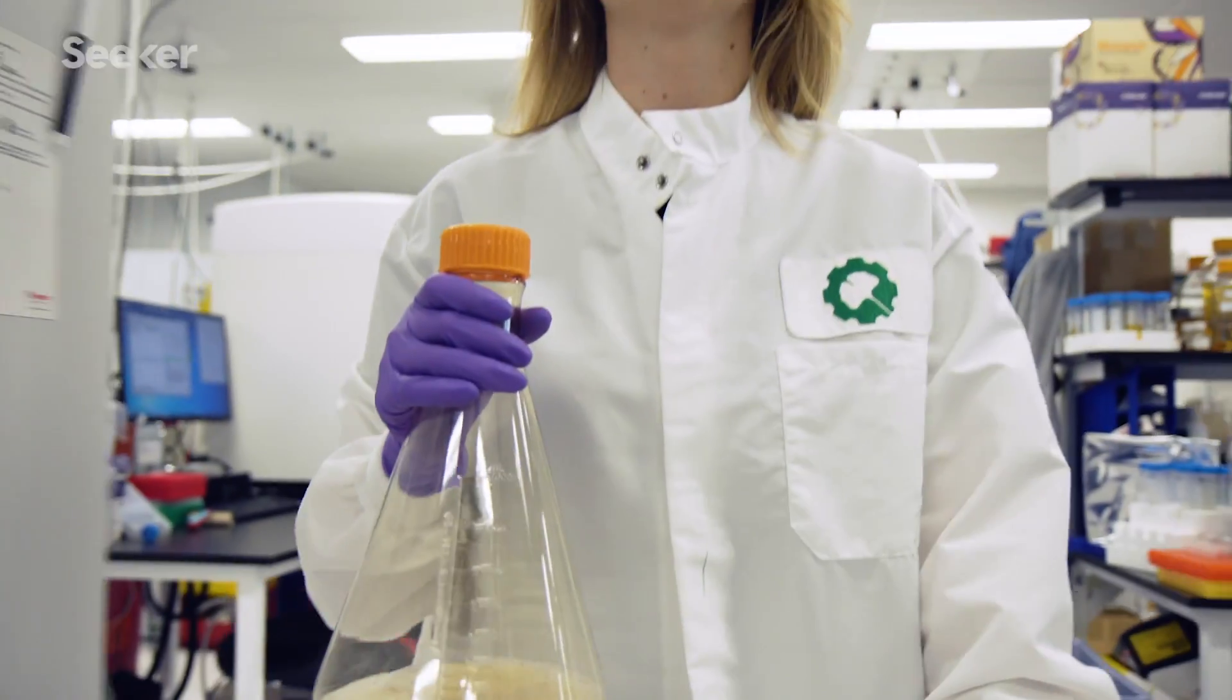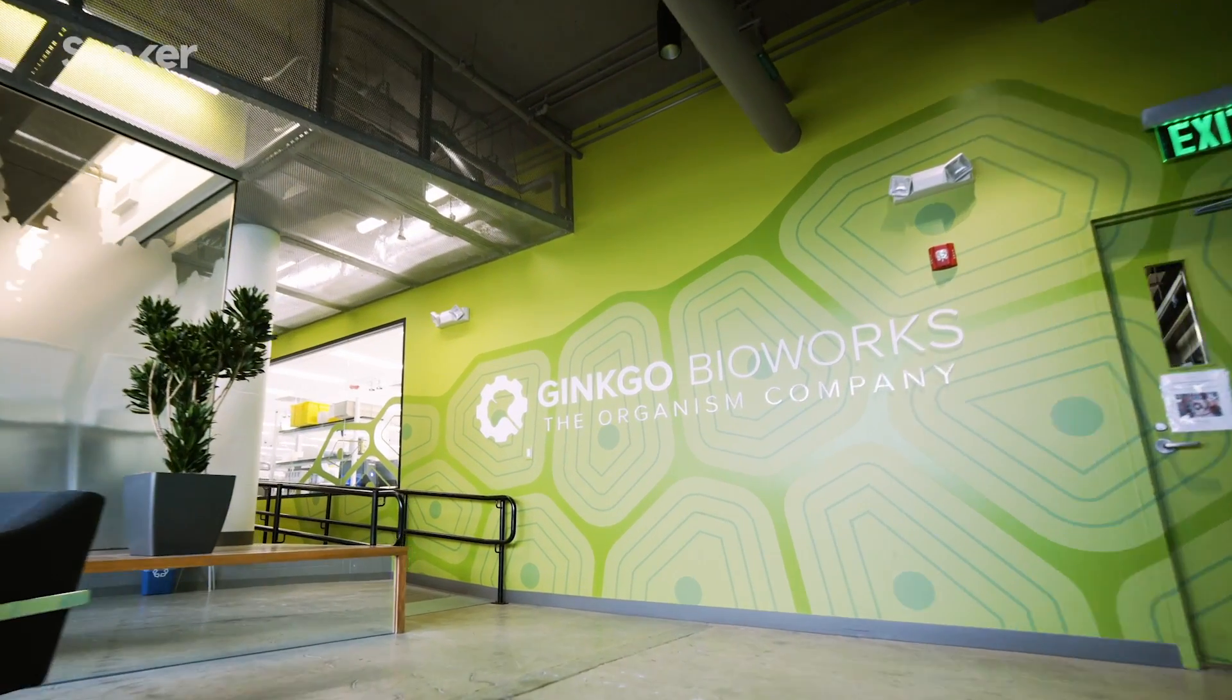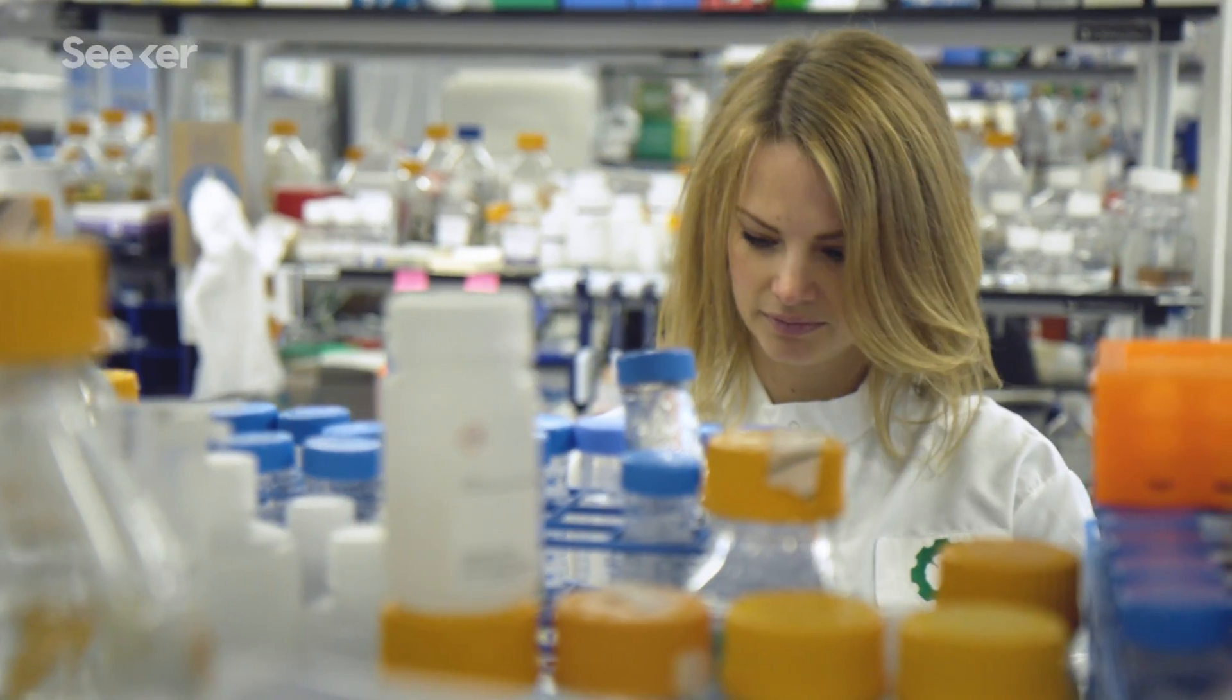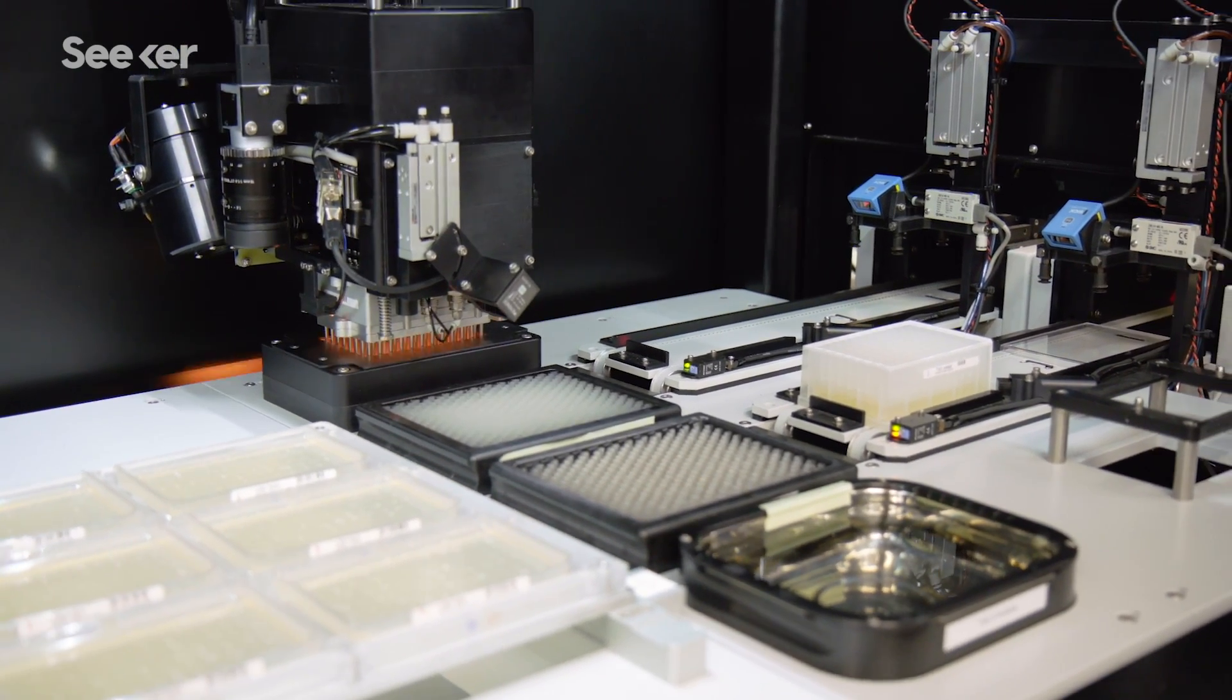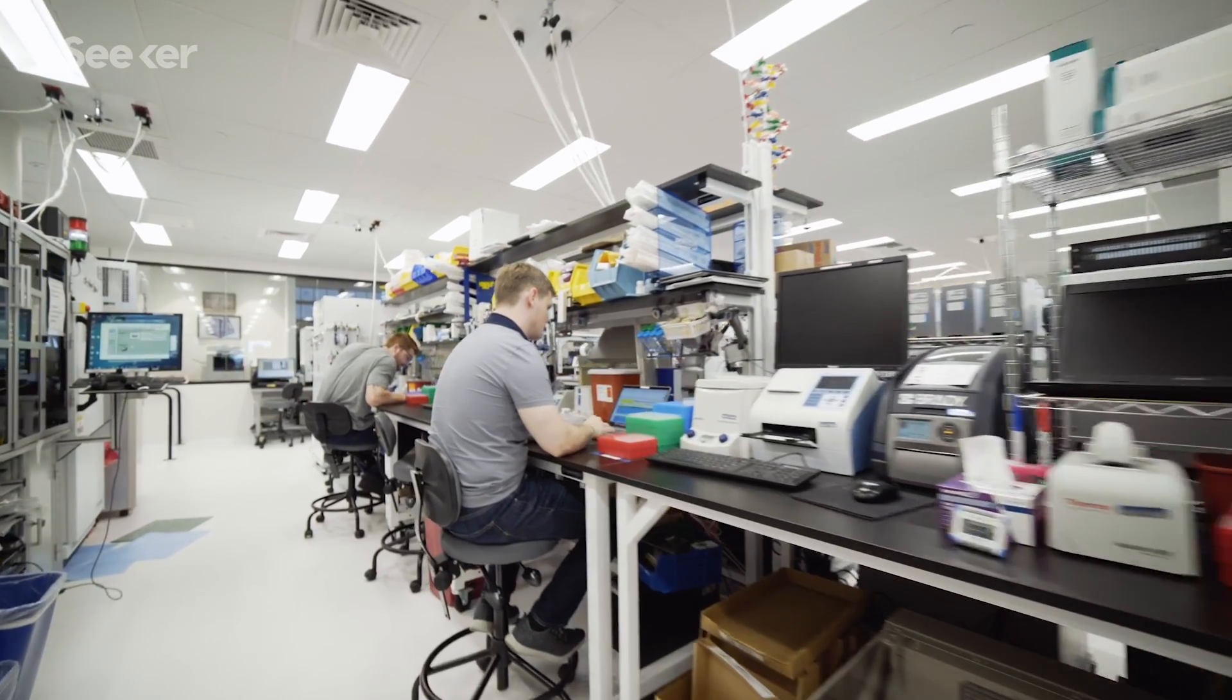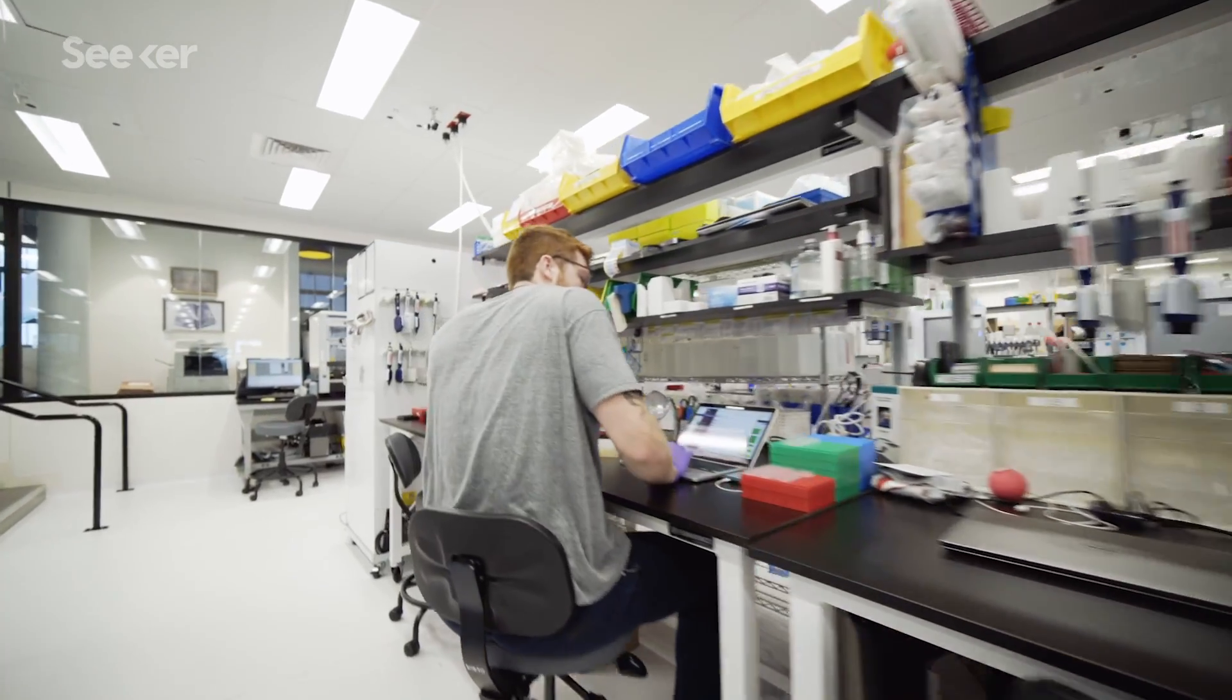Josh and Jade both work at Ginkgo Bioworks, a synthetic biology startup that's kicking this concept into high gear. They have unconventional titles like organism engineer and head of design, and give much of the lab bench work to the robots, freeing up their time for designing and tweaking. It's like taking a tour through the visitor center at Jurassic Park—just swap the dino blood for E. coli.